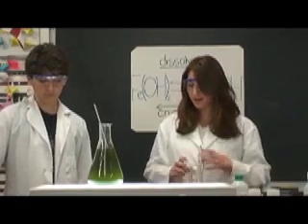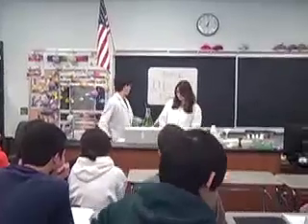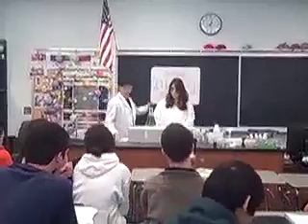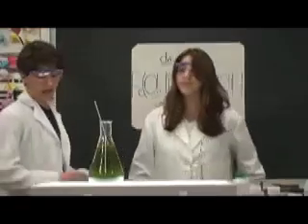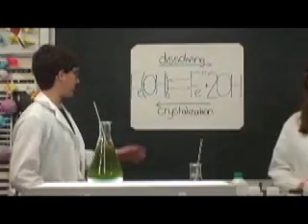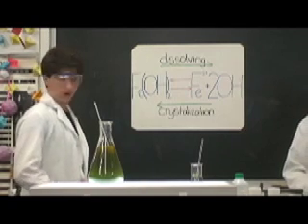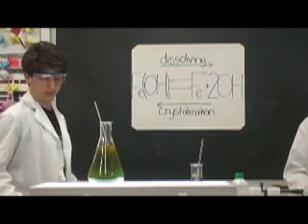Where did the chloride and sodium go? Did it form a salt? NaCl is soluble in water, so the ions are in the solution. The solution is saturated with iron and hydroxide ions, as you can see by this equation. The iron 2 hydroxide is at equilibrium with its ions, and this means that the rate at which the precipitate is dissolving is equivalent to the rate at which the ions are forming the precipitate.